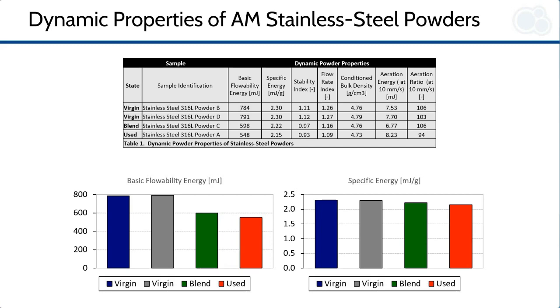Two things were noted when examining the SEM images. First, there appears to be more fine particles after usage. Second, there was more agglomeration present after usage. After looking at particle characterization results, a possible explanation for this behavior is offered.